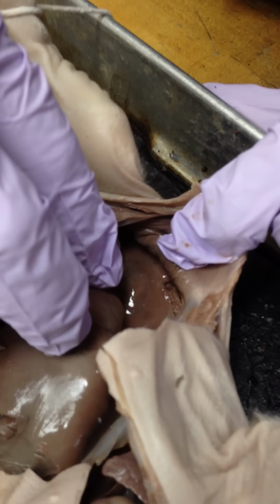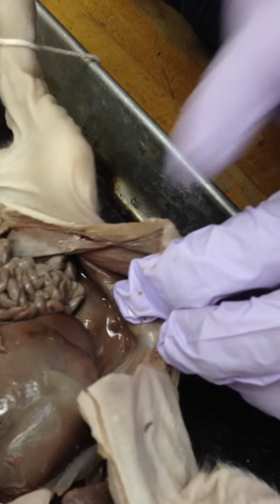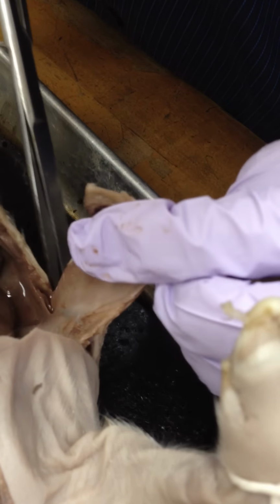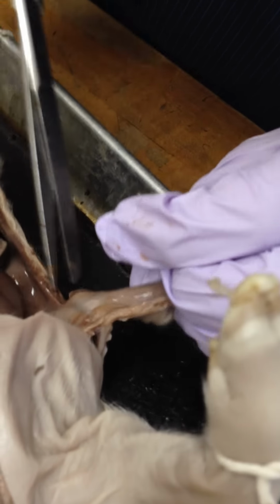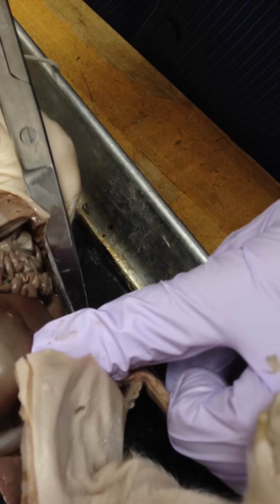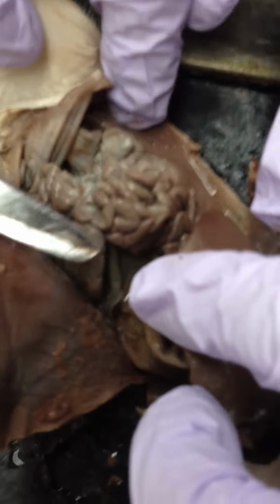Can't see it too well because there's kind of all the junk in the way. If you could just drain that, just cut the whole flap down there. Okay, let's go. I don't think the dead pig minds. I think the dead pig wants us to learn, and we will learn more by cutting him more. Yes, exactly. I want to try to open this up without chopping it to pieces. Okay, there it goes. Leaking open. Cool.